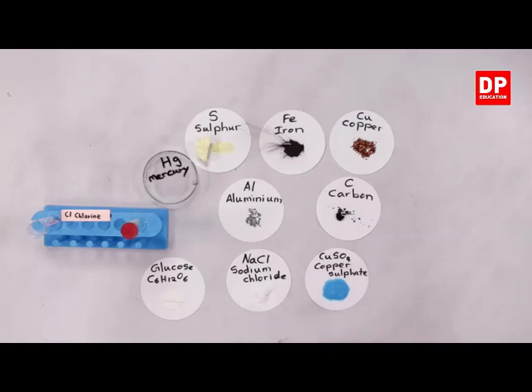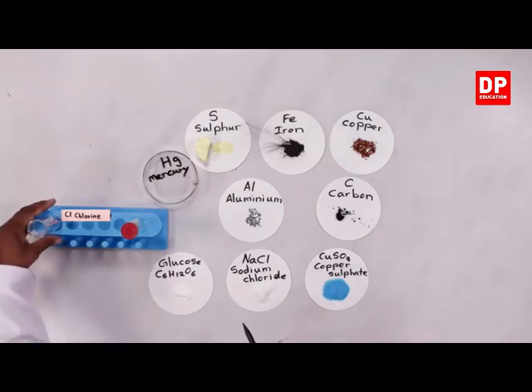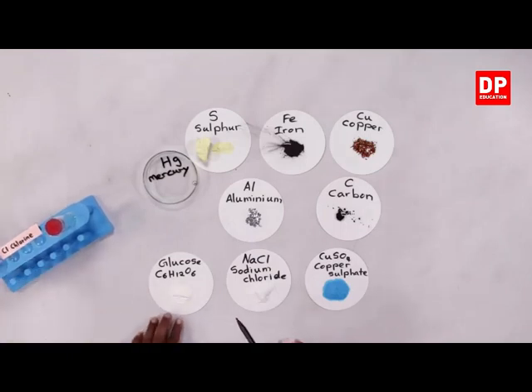Then we have sodium chloride, NaCl. NaCl is the common salt, sodium chloride that is available in our household as well. Those are white color crystalline solid substances, sodium chloride. And here glucose is something that you are familiar with. That again is a white color solid substance. So that is also something you all know.